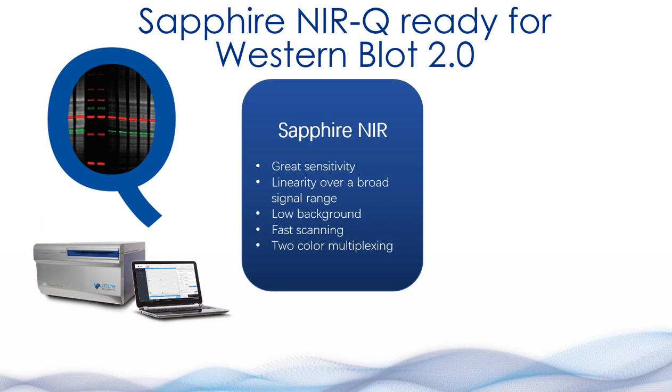Well, it's about total protein normalization. There's a trend in the market. People are going away from normalization against the standard housekeepers like GAPDH and beta-actin. And the reason is, of course, GAPDH and beta-actin is just one protein, right? So we're relying on normalization on one protein, and it depends on the cell cycle. The protein expression of these housekeepers will always go a bit up and down, right? So it's more robust, in case when you have a complex protein mixture, to put the normalization on all shoulders.